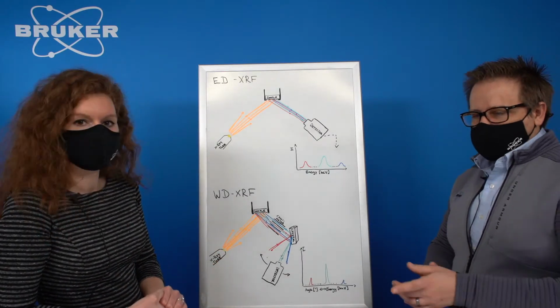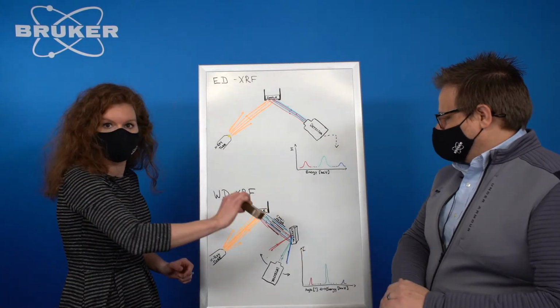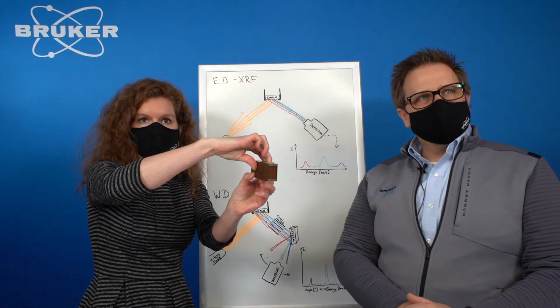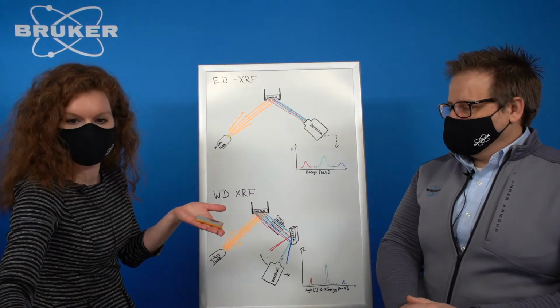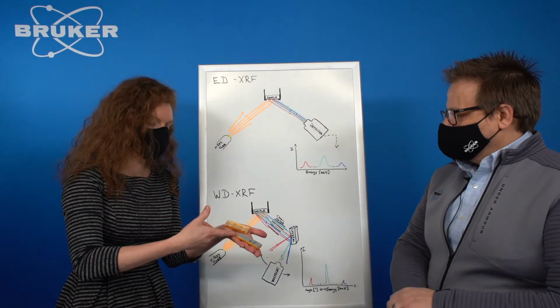So it looks like you had brought a few of the parts that we're actually seeing here. Right, we did. So this is what a collimator looks like. This is what parallelizes the beam, and you can see, oh, this is kind of hard with the camera. Only if I have it really parallel to your camera, you can see through it, right? Oh yeah, yep. And then the crystals, we do have several crystals depending on what elements you look at. This one is for heavier elements, this one is for lighter elements.